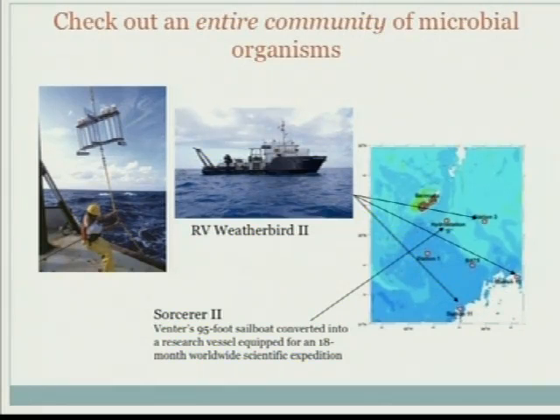And those DNA samples will be sent to a sequencing center so that you will get a lot of DNA sequences from a mixture of microbial organisms. So that's the whole point. Instead of getting reads from a single genome, you essentially get DNA reads from a collection of different genomes.